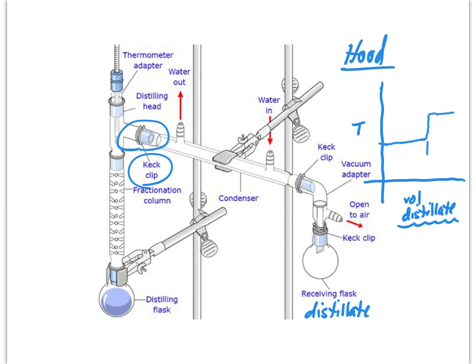And so this is really the transition from mostly one component to mostly the next component, right? And so you can monitor your distillations by looking for those breaks, right?